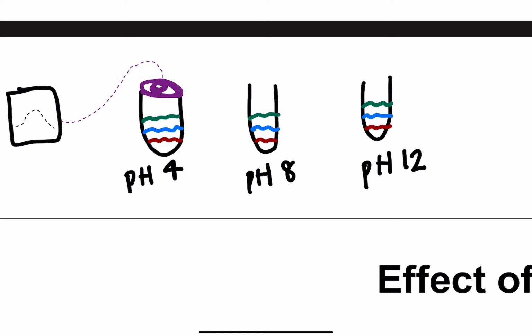So this was the same setup process that was repeated across the different variables like temperature and concentration, but all we did was adjust the conditions as needed. So for example, we followed a similar procedure for all of these independent variables. So adjusting that setup, it was dependent on what we were testing. When we were testing temperature, we placed the test tubes in water baths to set different temperatures. So when we tested for substrate or enzyme concentrations, we varied that amount of hydrogen peroxide or sheep's blood accordingly.